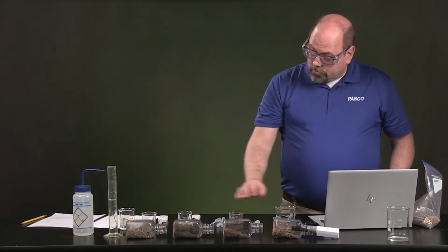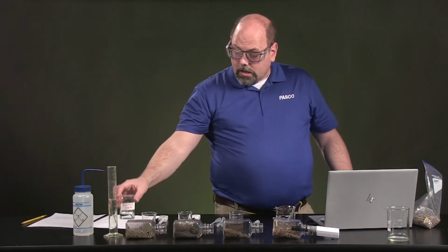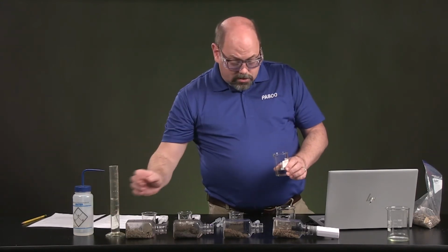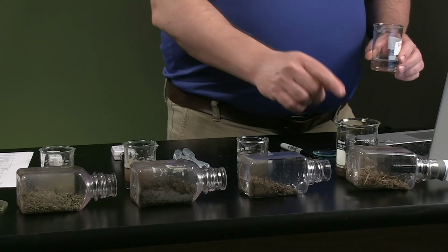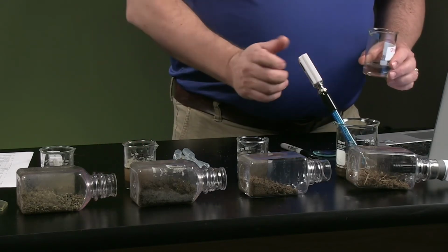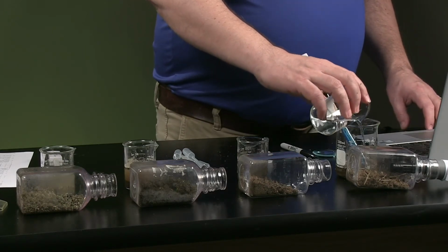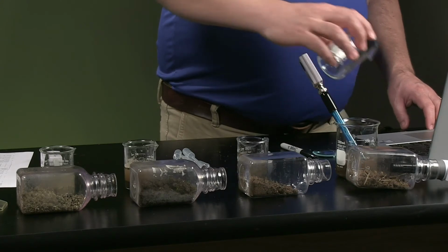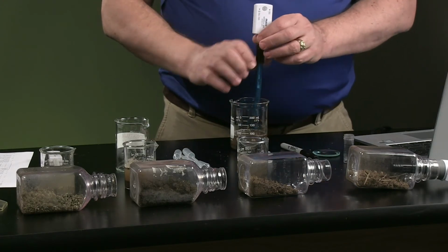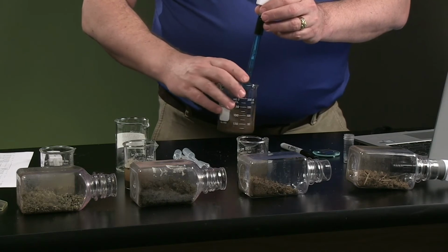Now, the last thing we're going to do is to determine the soil's capacity to resist an acid change. So here's where I poured 40 mL of my vinegar into a separate beaker, and I was going to then introduce that to this first soil sample, which came from the grasslands. I'm going to go ahead and pour in the vinegar. What I think I'll do is just give that a little bit of a stir, just to make sure that mixes thoroughly.